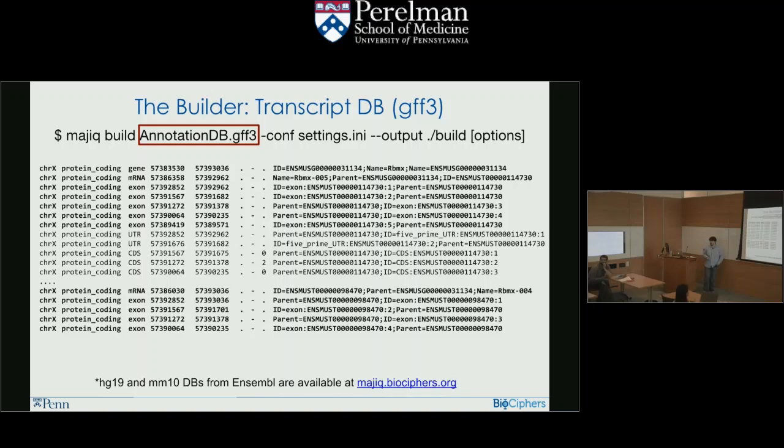Yes? So a gene is a maximum boundary of all the mRNAs. Yep. So what if it has two mRNAs that transcribe in different directions? In different directions. So if you wanted to pick that up, a few things.